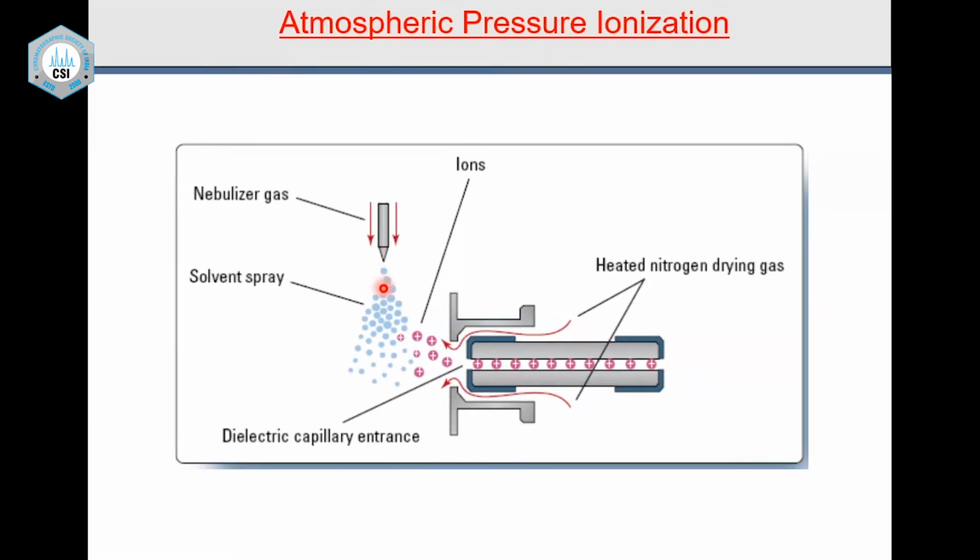Please listen to it very carefully. Through the inside one, the liquid comes out of the HPLC. The HPLC tube is connected to this bilayered needle, the nebulizer. And from the outside of the needle, there is gas flowing at several liters. So when it comes out, like a perfume spray, you get very, very fine micro droplets.